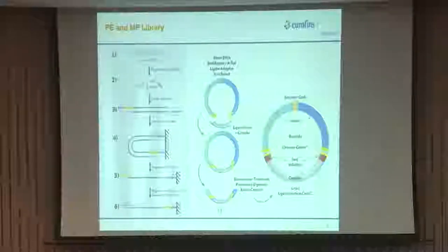In a particular NGS sequencing run, not only one sequence goes. There are many other sequences. To segregate one sample from the other, we have an 8 base adapter, which is called indices or barcodes. These 8 bases segregate each sample's sequences. Hope you are following me. These small 8 base sequences for that particular sample will be exactly identical. Based on these 8 bases, we segregate the data sample wise.